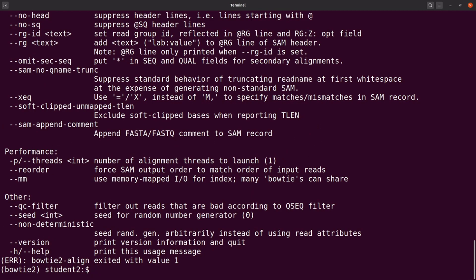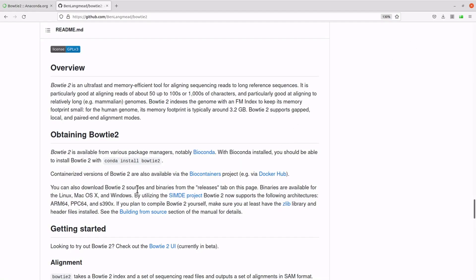Once you have it activated, you can test Bowtie2 by just typing: bowtie2. And it works nicely for us. So now you can use Bowtie2 to perform your alignments. That's how we install Bowtie2 using Conda. There are other approaches you can use to install Bowtie2 — you can compile from source, use binaries, or use bio containers like Docker. You can see all of them on the GitHub page, so just check that section to see all the different approaches.